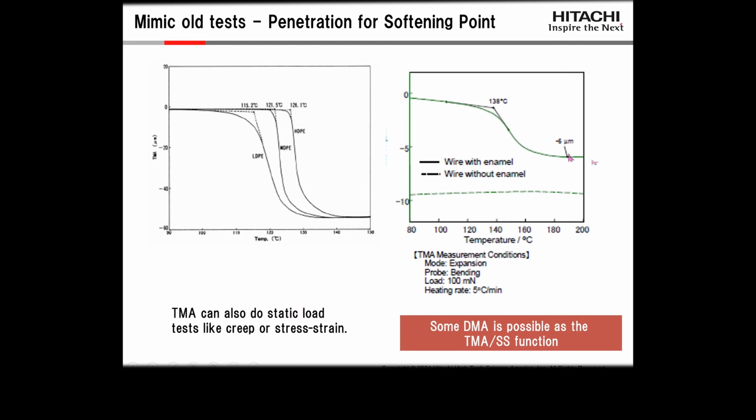One advantage of that even today is if you have a wire with enamel on it or a coating over a metal surface, a penetration test will allow you to actually measure that material on the surface by penetrating down against the base material, so that you can actually test something without having to scrape the coating off the wire or the film off the disc or whatever.